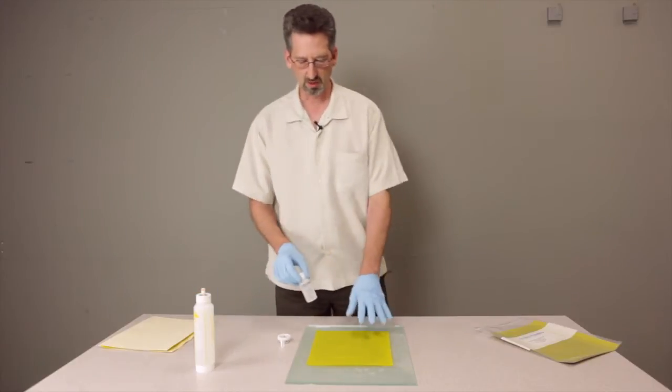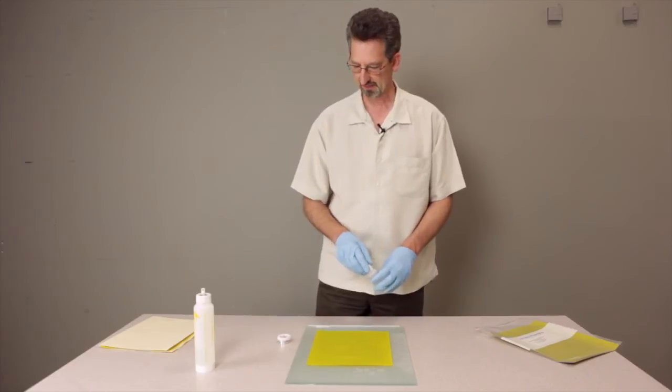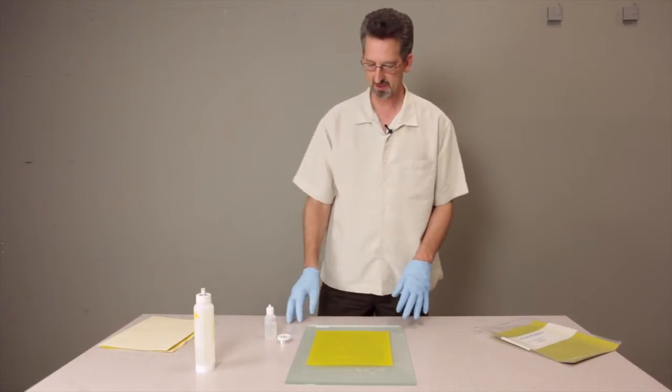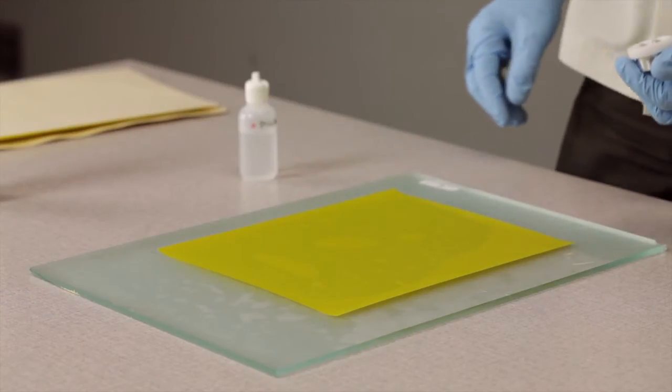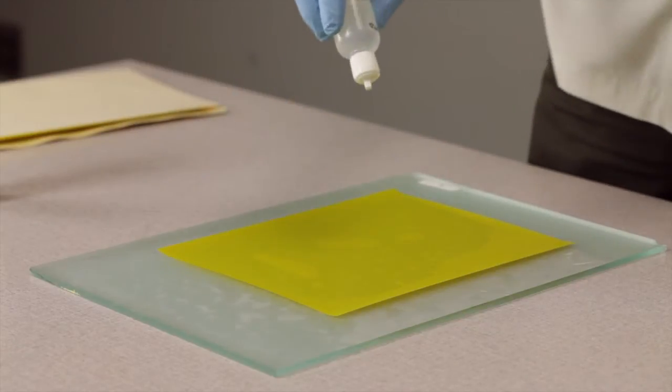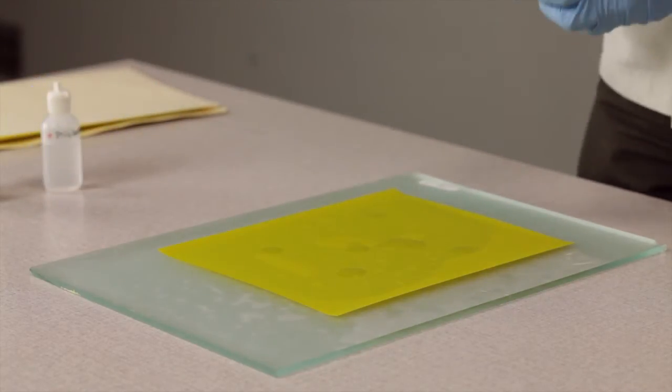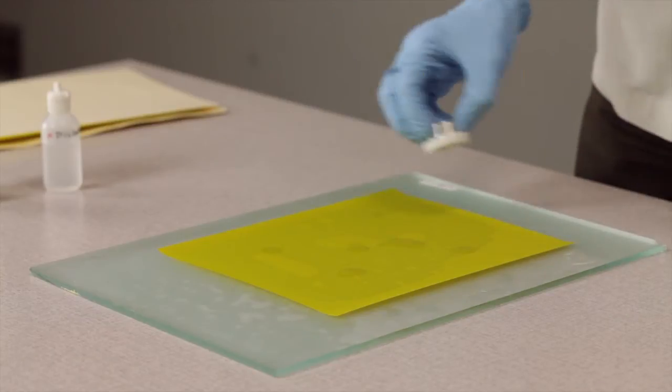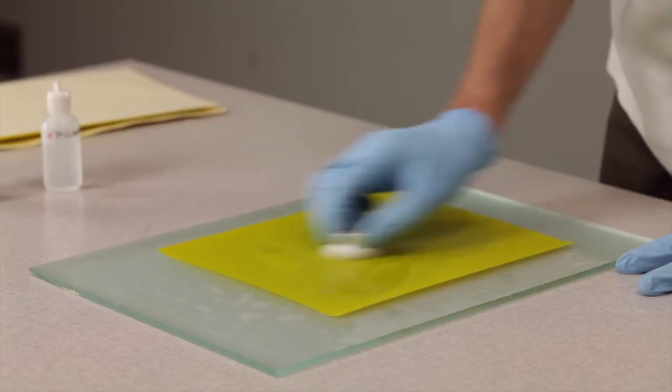So for our lubricant, we use Stoddard solvent, a non-aromatic hydrocarbon. And that's going to sort of smooth our way through the polishing. We'll add, you know, half a dozen or so drops. And that's enough for lubrication. We don't want to make it super wet because then the sample is just going to be floating over the surface.